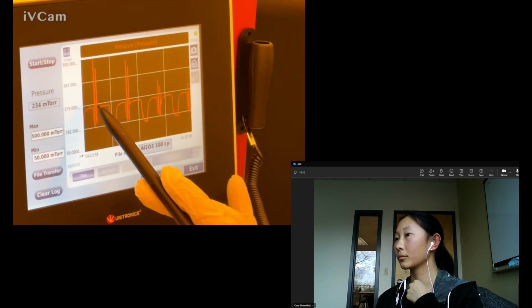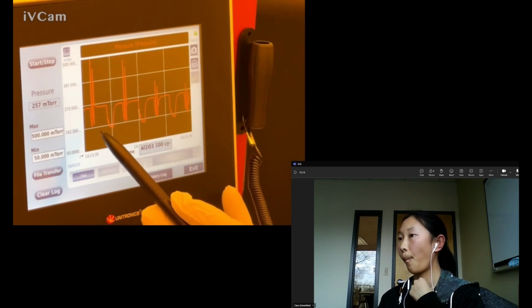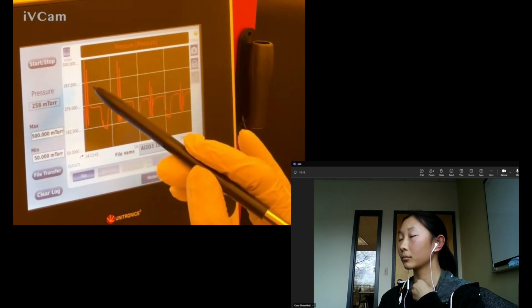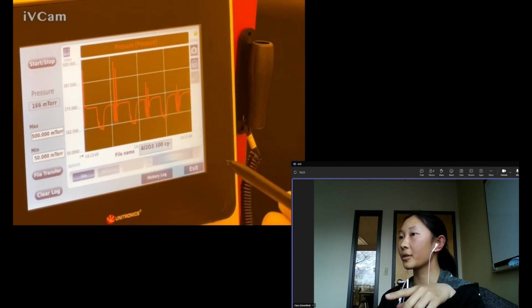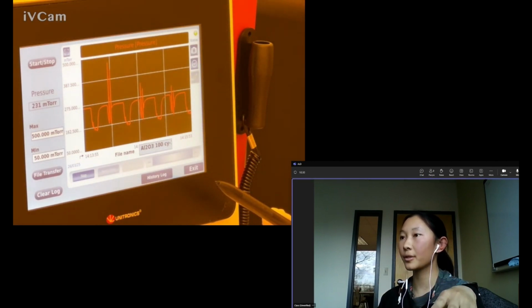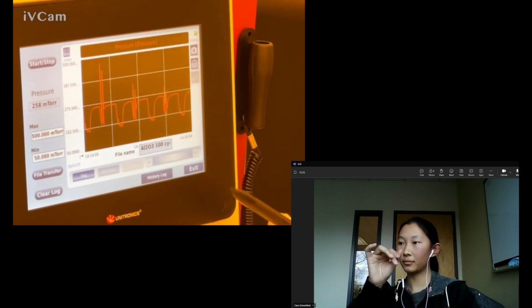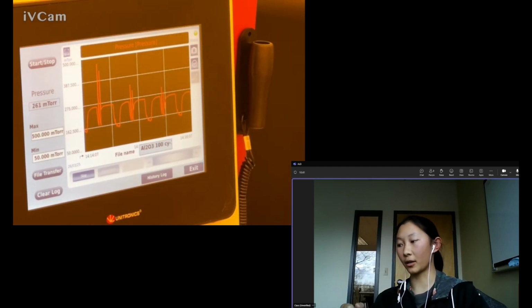So these peaks have reduced here for whatever reason, compared to these. So this shows pressure in the chamber, right? Yeah. Is there a reason why that may be happening? The peaks here do not correlate with those peaks over there. Those peaks are probably the water. The water pulse can be large, and if you're first starting to use the water pulse, there's probably some air still trapped in that line, since the water doesn't have a valve on it; you just connect it directly.